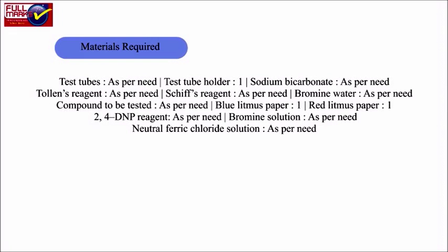Materials required: test tubes, test tube holders, sodium bicarbonate, Tollens reagent, Schiff's reagent, bromine water, compound to be tested, blue litmus paper, red litmus paper, 2,4 DNP reagent, bromine solution, neutral ferric chloride solution.